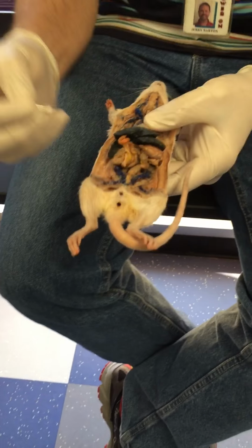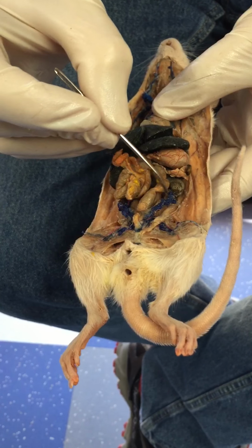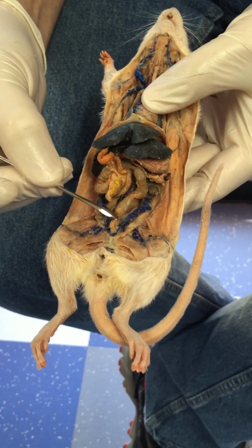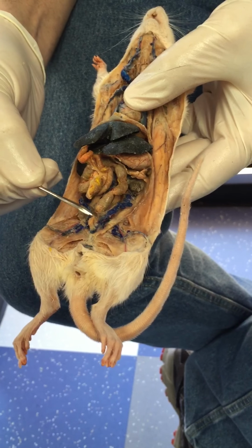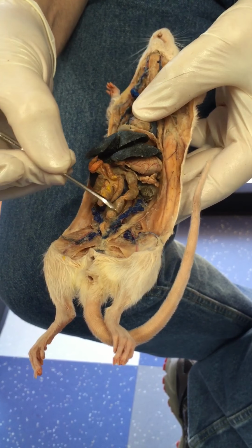Perfect. So see the little bitty urinary bladder here? And then you can see this Y-like looking structure with these blue veins wrapping around it, going back like that on both sides. Those are the uterine horns, whereas right behind the bladder, the base of the Y is the uterus. So in humans, there's just the uterus and there are little fallopian tubes coming out to the ovaries over here. But in cats and rats, you have the uterus and the uterine horns going all the way up here to the ovary at the tip.